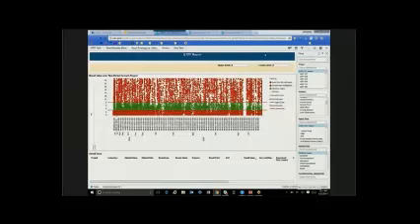That's what this is. Every 15 minutes, all the data from the notebook is automatically pushed to the data lake, and now they're living in one place. And we can also get our legacy data from the notebook and the LIMS system, all living there too. Because of the consistent terms from Allotrope, now I can easily pin them together. So that's the exciting part.